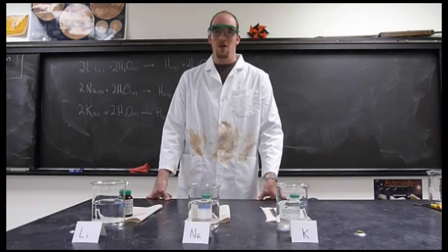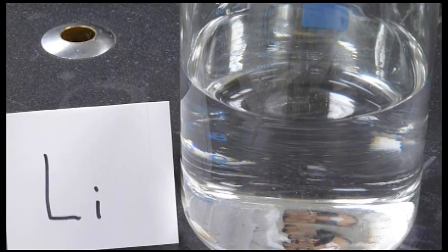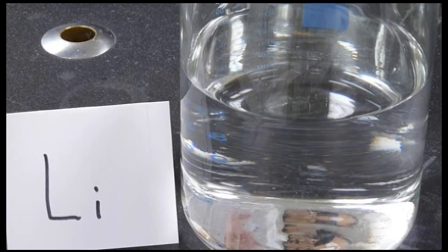So, let's get right to it. Okay, so the first alkali metal I'm going to show you reacting with water is lithium.